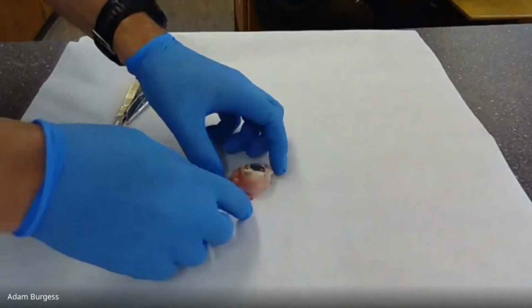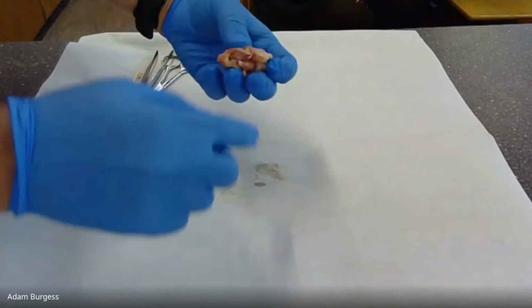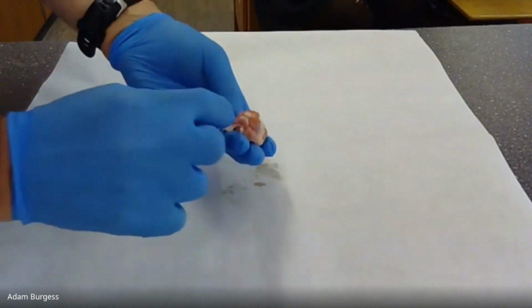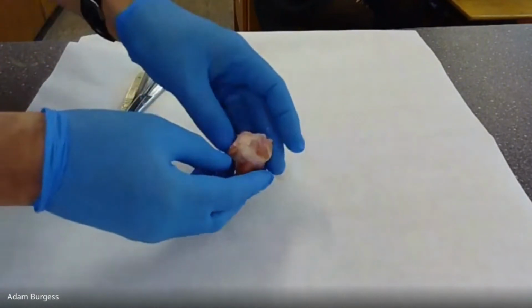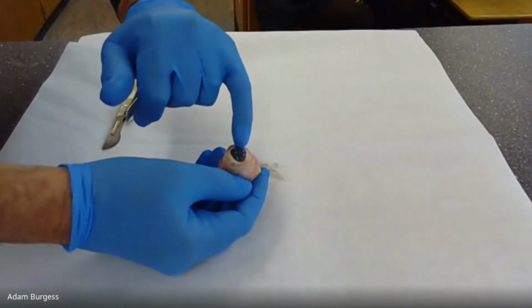Right, okay, on to the eye dissection. This is me demoing the eye dissection. Hope you enjoy it. Obviously, there are more videos coming on the eye soon. You'll get the eye, and it will have lots of things around it, particularly muscles. You might even be able to spot the optic nerve. There's the optic nerve. And then we've got the sclera, and then the cornea.